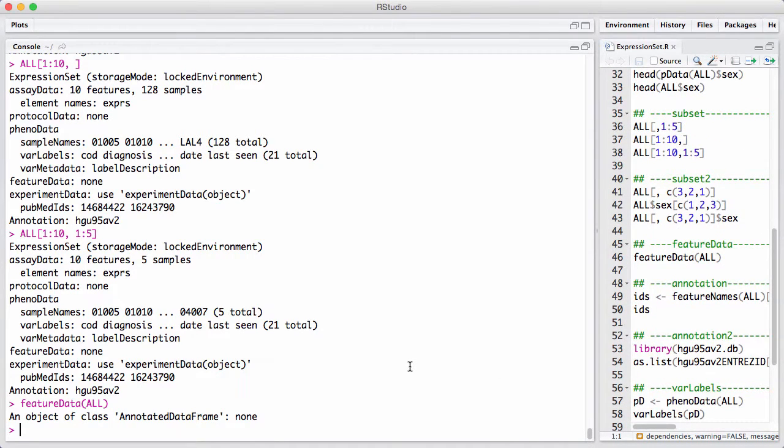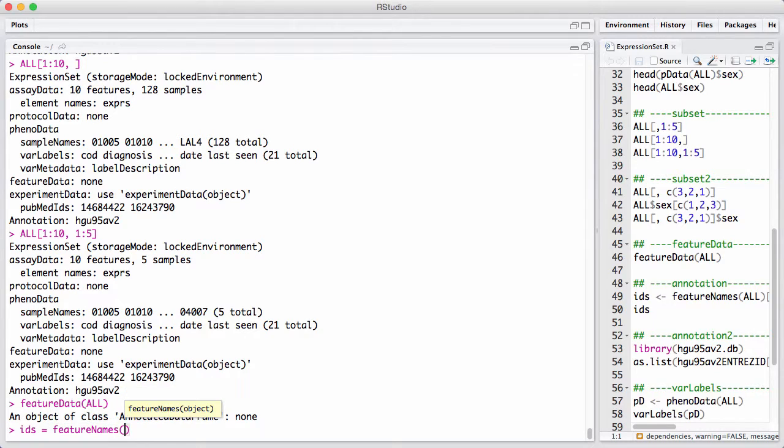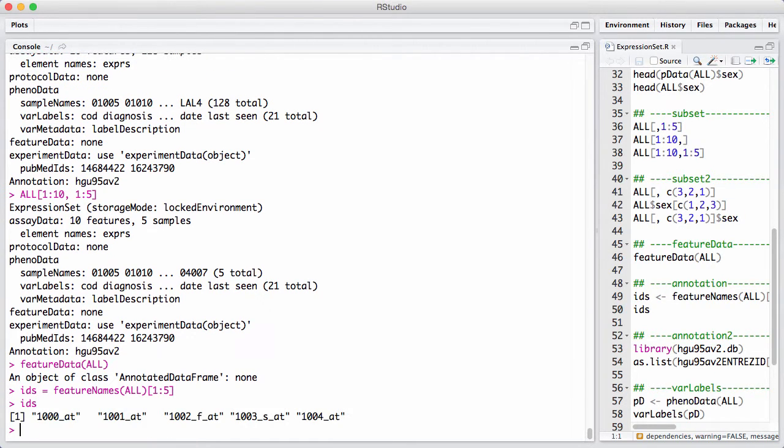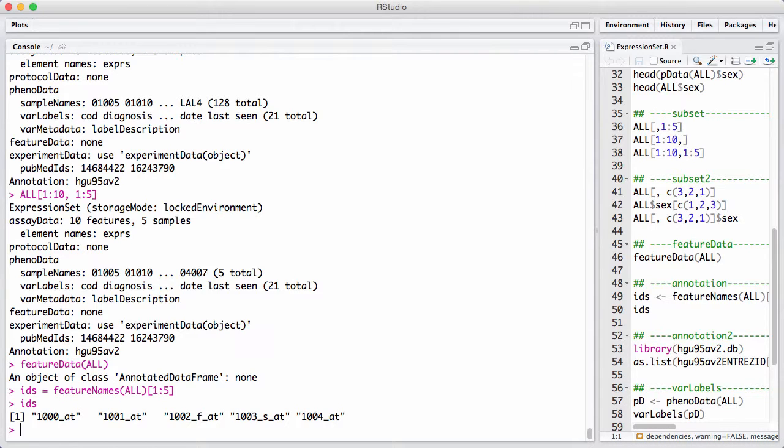Now, let's look a little bit about annotating or understanding what was measured on the array. So, let's get the first five feature names. These are these identifiers we've seen before. They don't really make sense. These are identifiers that the microarray vendor decided to put on the different genes. In order to fully understand what genes were measured on the array, we have to take these identifiers and map them into gene symbols in a way that makes sense.